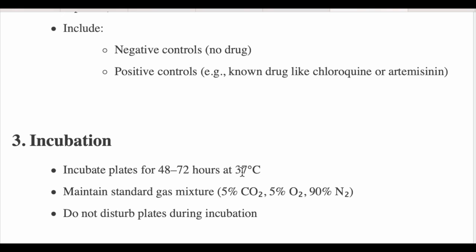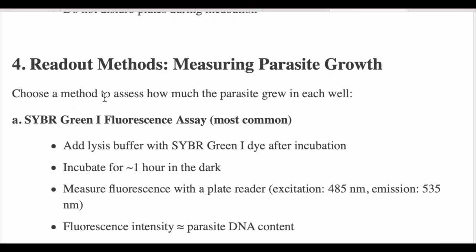And you don't want to disturb the plates while they are incubating. Then now is the readout. You want to measure the parasite growth in the presence of the drug that you're testing. So you choose a method to assess how much the parasite grew in each well.